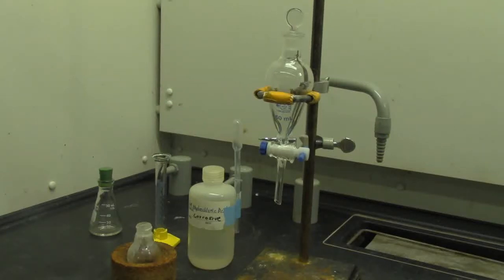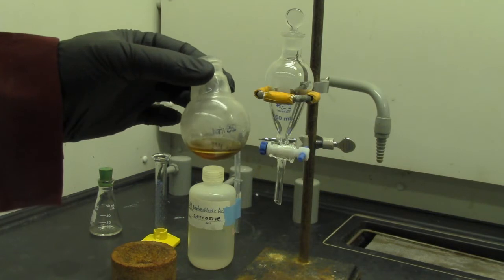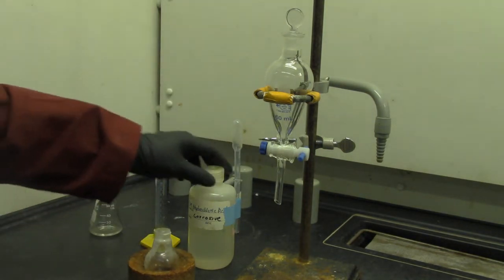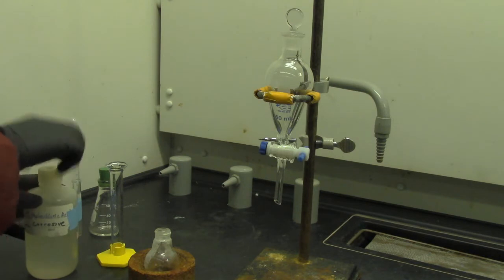Okay, so today we're going to do the hydrolysis of the Grignard compound. So yesterday we made this Grignard compound, right? So we have this from yesterday, and I'm going to add 10 ml of 6 molar hydrochloric acid.